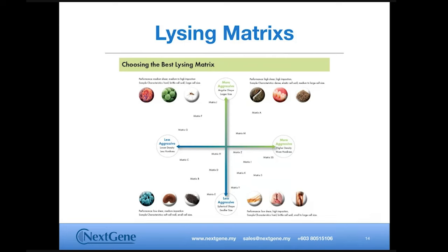Okay, the second question from Wanwan as well: what is the recommended starting material for DNA extraction for maximum yield? Okay, so this one I think I already covered. I interpret it as the amount of the starting material required. If you are talking about the sample type, then our kit can process feces, soil sample, water sample, and all that.